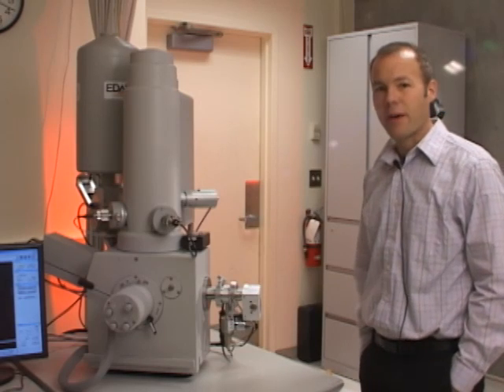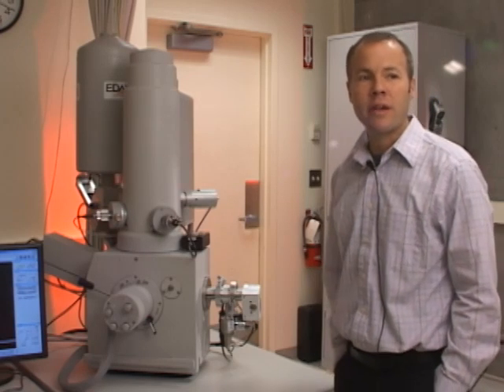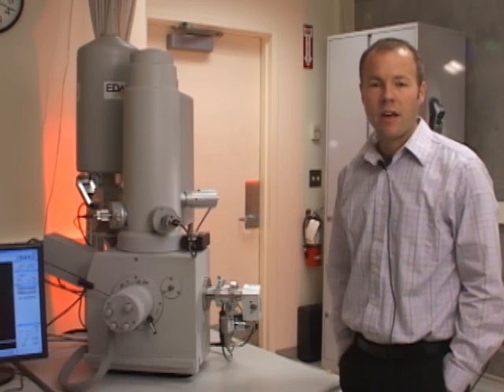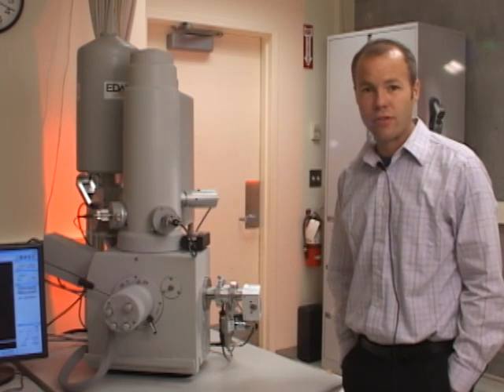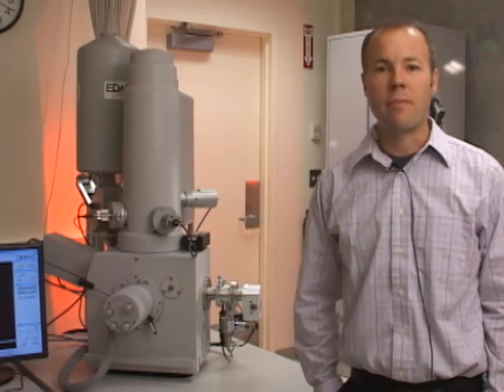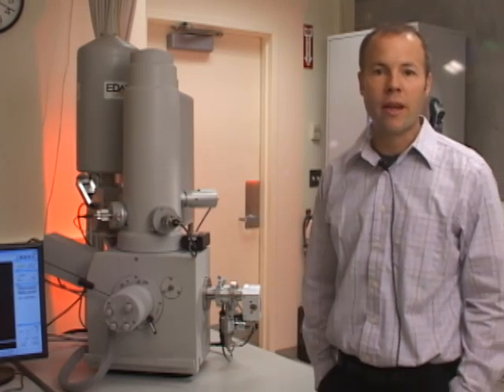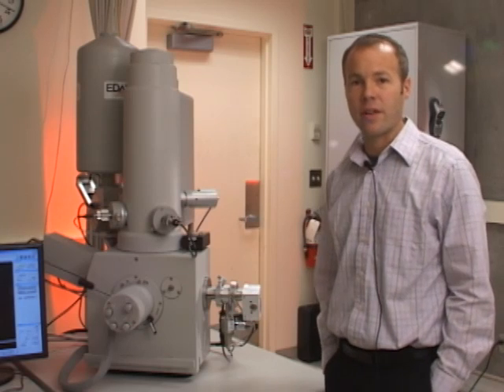The basic science behind scanning electron microscopy is pretty simple. It's been around for more than 50 years. It's a way of beating the diffraction limit of light — any item smaller than half the wavelength of light is too small to see with a light microscope. Electrons have a much shorter wavelength, so we're able to image structures at the nanoscale.